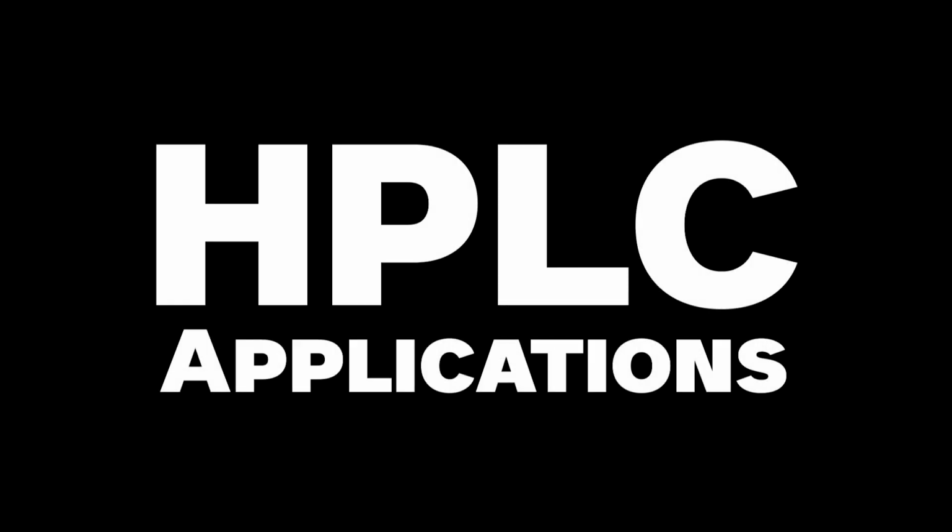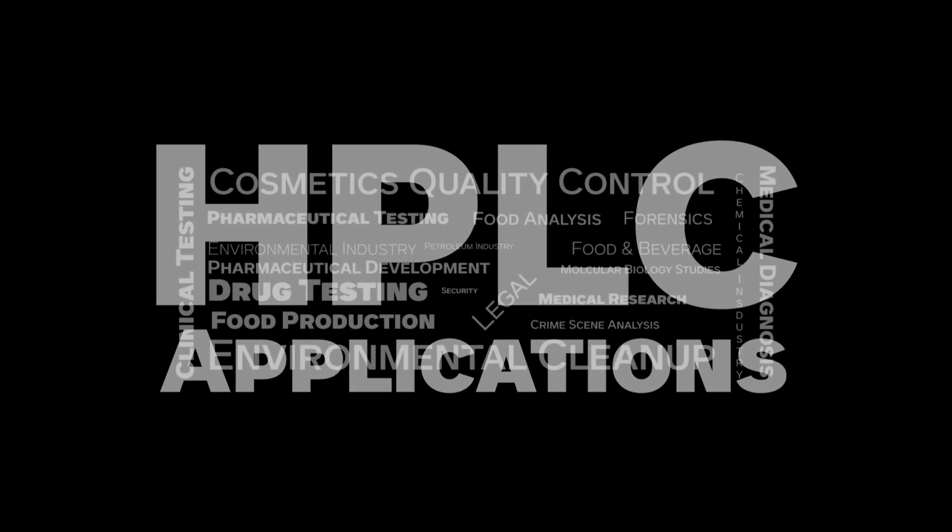Chromatography, as an analytical technique, is the most widely used methodology in analytical chemistry. The most deployed form of chromatography is high-performance liquid chromatography, or HPLC. HPLC is a powerful analytical technique used for the separation, identification, and quantitation of complex mixtures of chemicals.